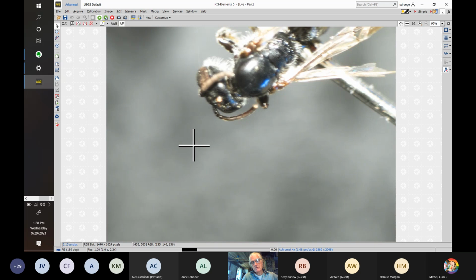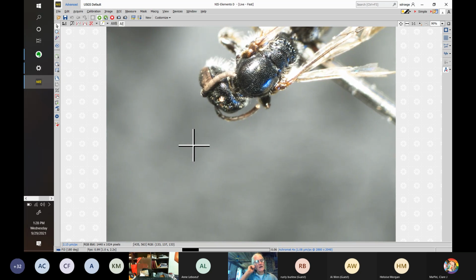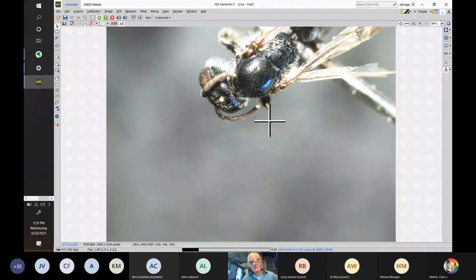So this particular species is our native. There are two non-native species in the region. Those are in the northern part of the east. I'm not sure how far south they will spread. So here's the tegula. This is the scutum right here. This distance here is shorter than the distance from here to here, the length. It looks almost equal, but I would agree with the statement that this distance is shorter than that distance. That's what you mainly have in terms of, if you go through, yeah.